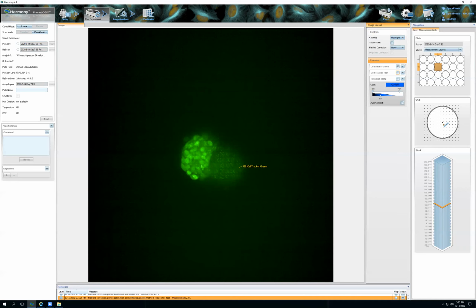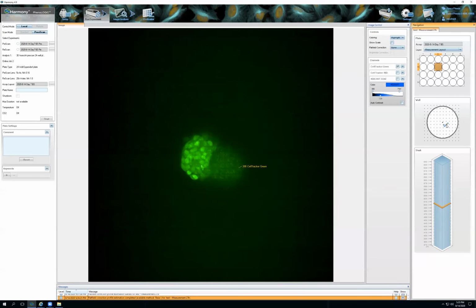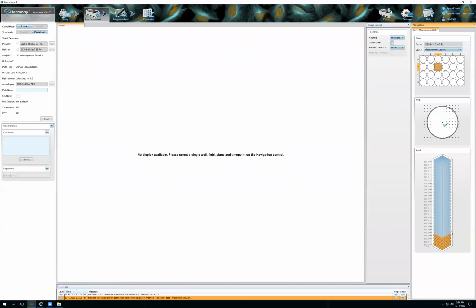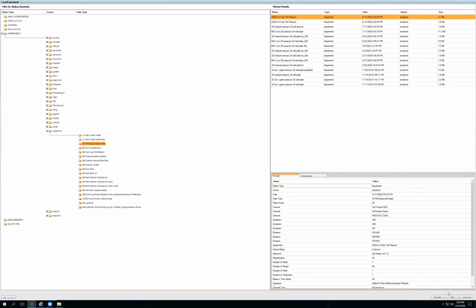So we have a lot of changes to make. Now I would look at this image 5 nuclei. You can go through and look at all of them. You want to just make sure that your whole sphere is here. You can write down where it starts and where it ends so that you know roughly how big it is, so that you could say, I don't really need to image this and I don't really need to image this. You can reduce your height. So now if we go back to setup, we're going to load our rescan, which is what we need to edit.